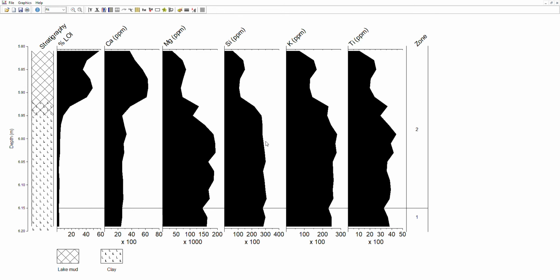Rather, in the lab computer, if you go on the Windows button, you can find the snipping tool, and I'd use the snipping tool to cut out the diagram, leave behind all the menus and stuff. Just trace round where you want the diagram and cut that out with the snipping tool, and you can save that as a JPEG, and then obviously with JPEG you can work that straight into your report. That should be fairly straightforward.